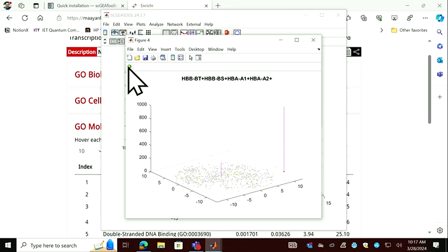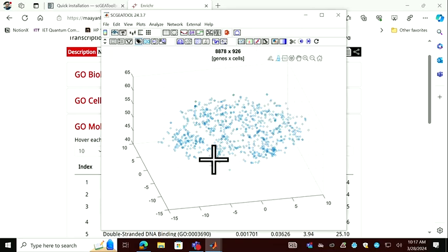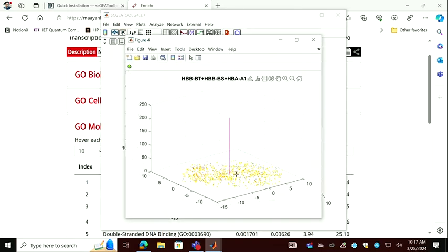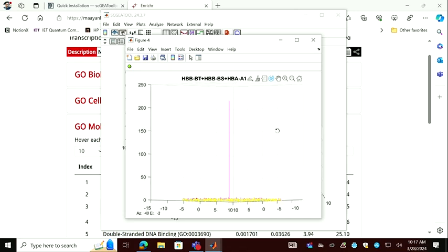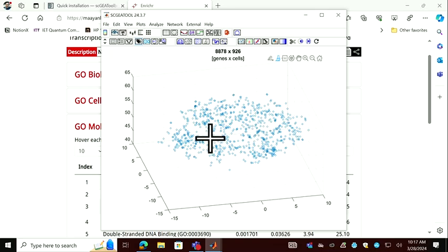Yeah, so I haven't developed a function to delete it, but if you know this cell, you can highlight and delete those two cells. So after that, view hemoglobin again. I still have one. But those low levels should be fine. It's very small. But this one, if we can delete that, it will be good. That's one in the middle.